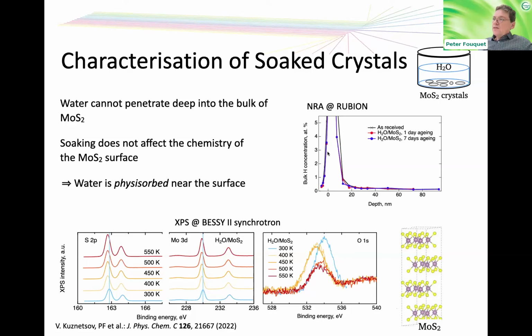And there you see basically no hydrogen in the sample beyond the absolute surface layer. There's no signal in the deeper depths.